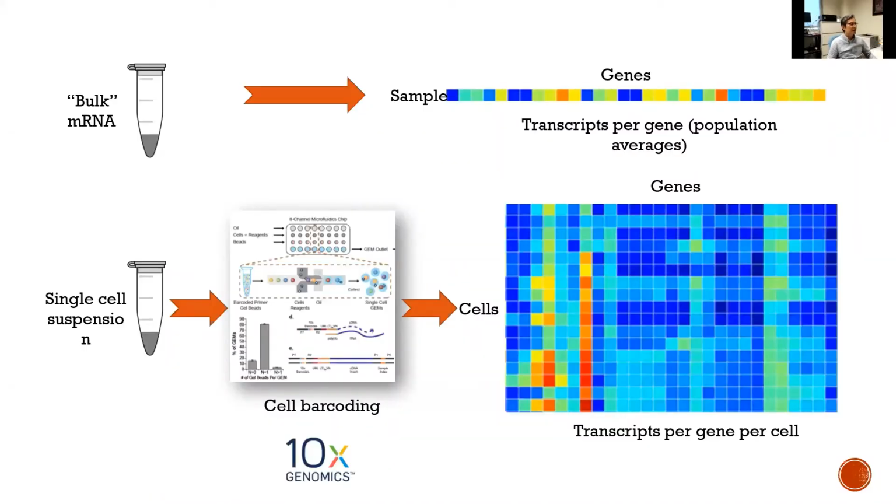Okay, let's move on. So far, I mentioned that single cell RNA-seq provides our ability to identify highly variable genes, and highly variable gene identification is a main approach to do feature selection. You want to use those highly variably expressed genes as a much smaller data set to do downstream analysis. The reason is you can use them to capture the diversity of gene expression across cells.